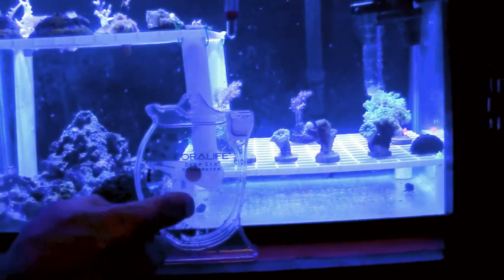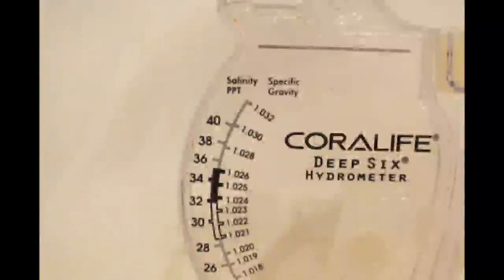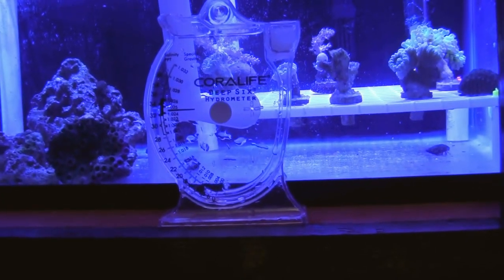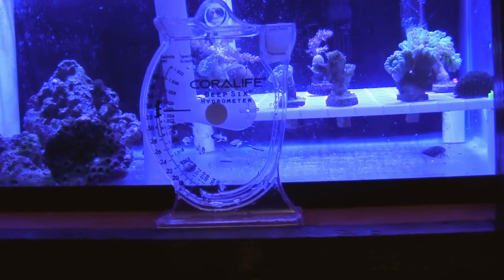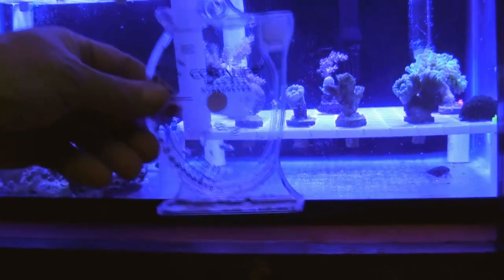The standard measure for salinity is 35 ppt, or 35 parts per thousand. The salinity measures are marked on the left side of the graph, and on the right side is the specific gravity reading — the measurement of weight for the density of the water. If the swing arm reads 35 ppt, the specific gravity is 1.026 units. The chemistry of salinity and specific gravity in salt water is complicated, but these devices help hobbyists keep their tank environments healthy for their livestock.